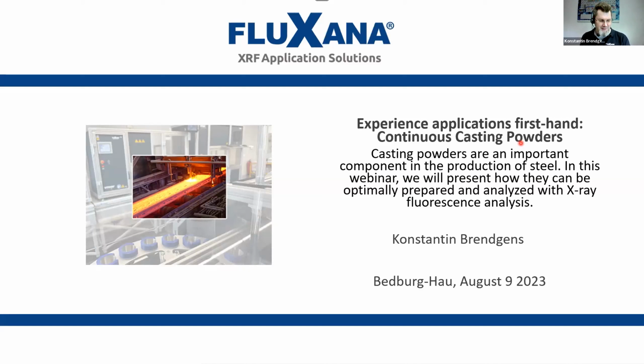All right, having that out of the way, let's get started with today's topic. As already mentioned, we'll be talking about one of the applications, or in this case, multiple ones that we run here at FLUXANA Laboratory. The material we'll be talking about is continuous casting powder.